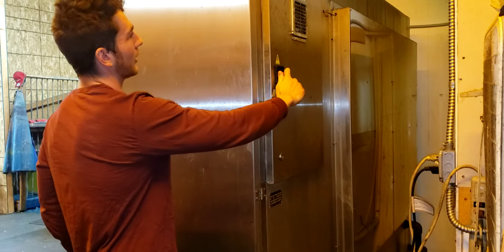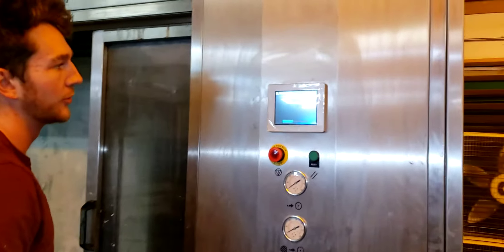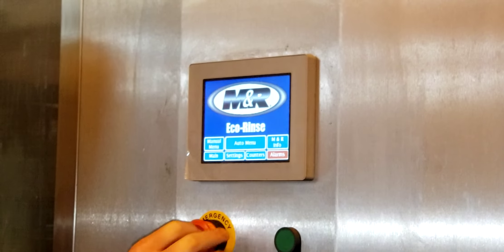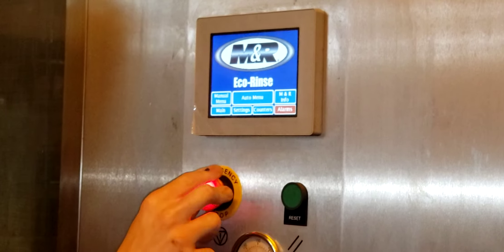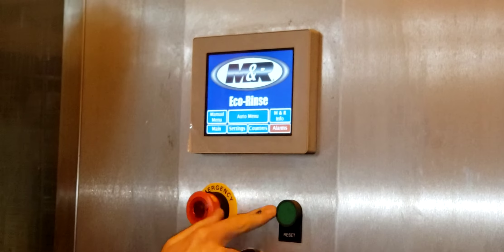All right, so now we're going to turn on the ECO Rinse Wash. It's going to boot up. We're going to press on the emergency stop, press the reset button, and turn it to the right. That'll reset the alarm.